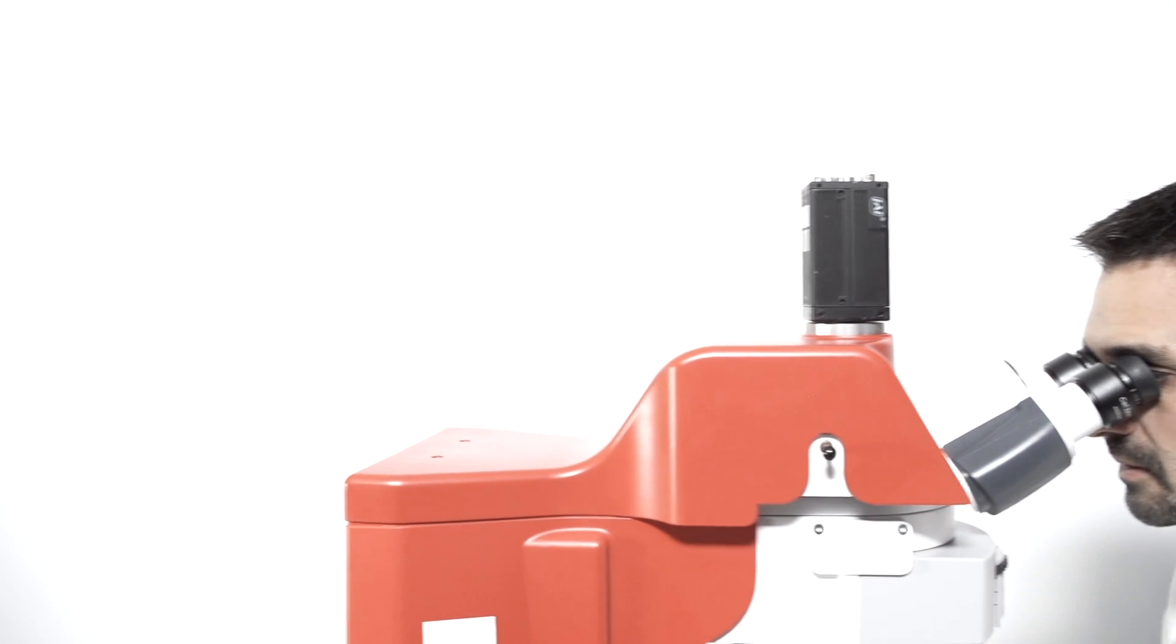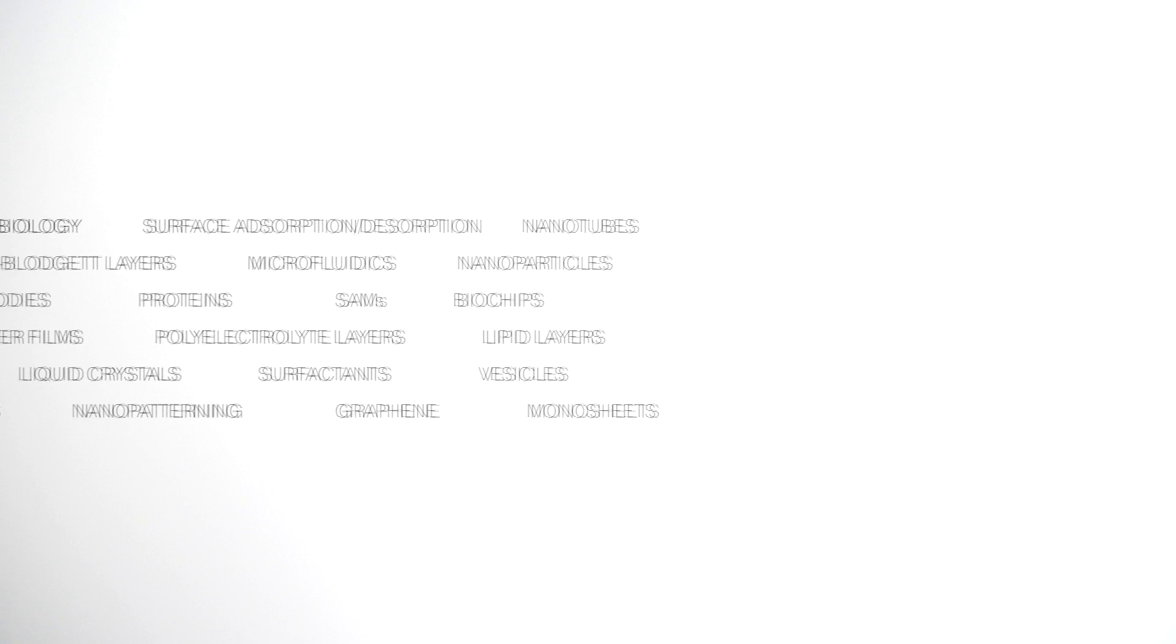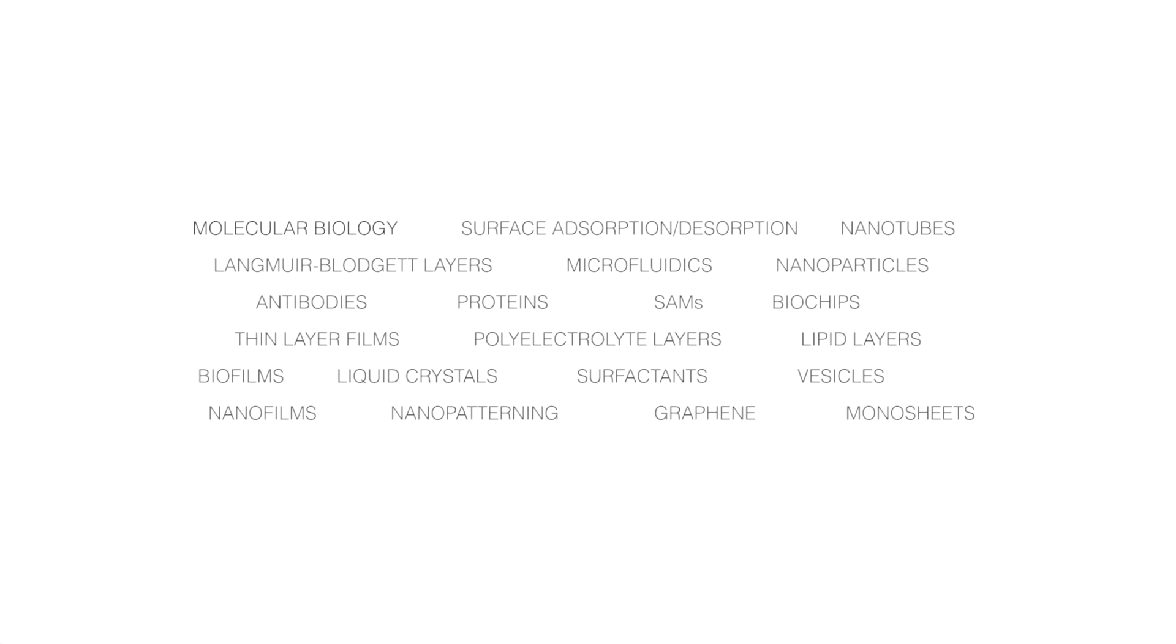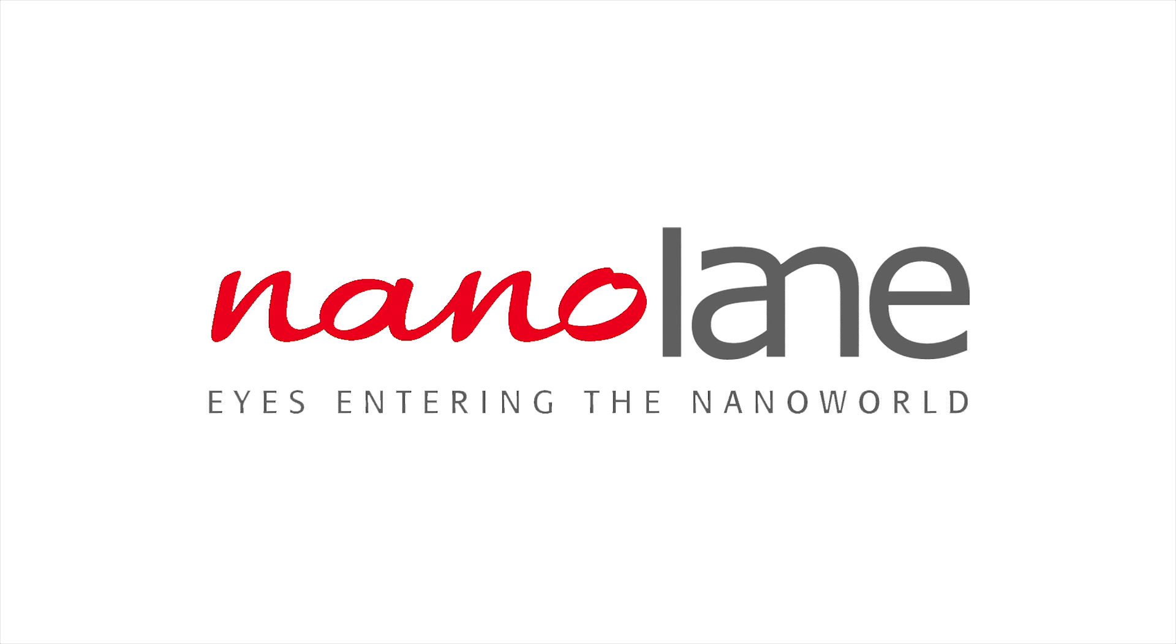The Surface HR system is the ideal tool for nanometric scale visualization and characterization, thin films and patterns topographic studies, and molecular interactions analysis. Let your eyes enter the nanoworld.